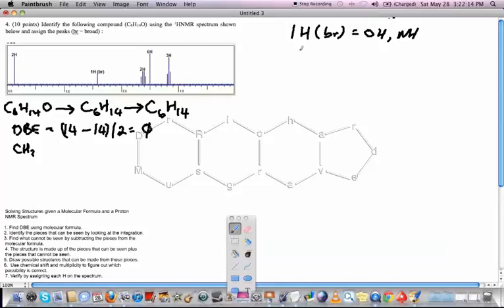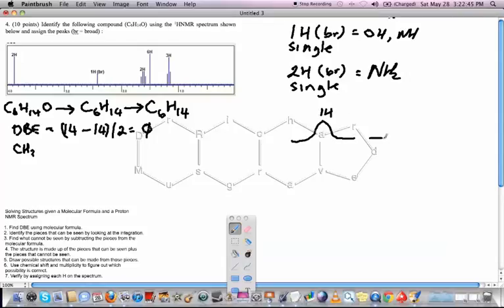Now further, this will be a single peak, meaning it won't be split up, and I'll explain why in a second. Or you could have a 2H broad, and that's going to be a single peak as well. And that's going to be an NH2 group. Now when I'm talking about a broad peak, what I'm talking about is something that looks like this on the spectrum. That could be a 1H, or this one being a 2H.